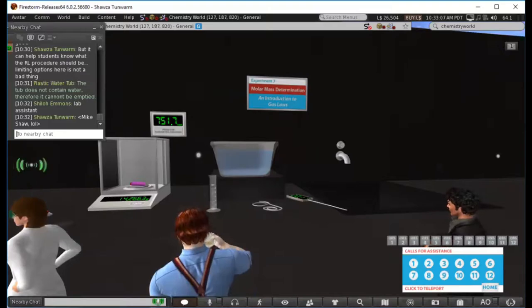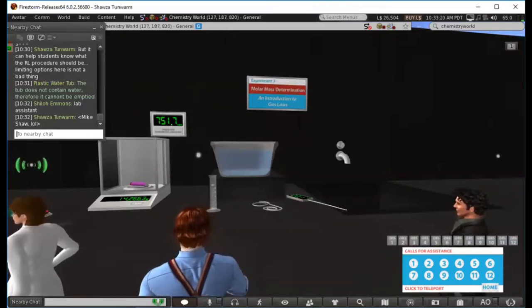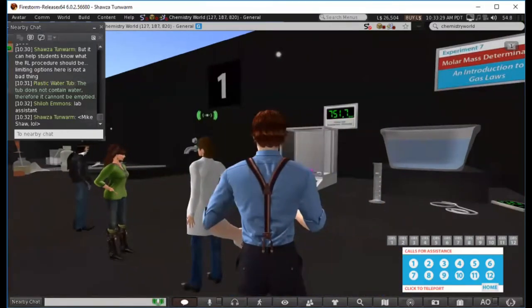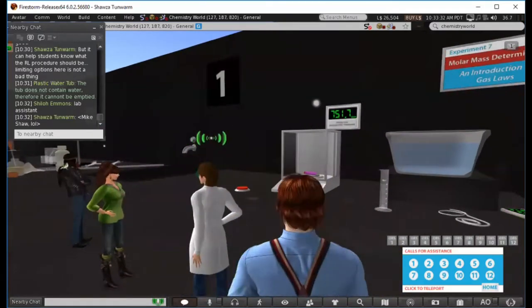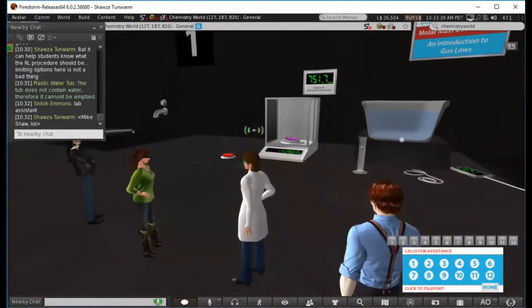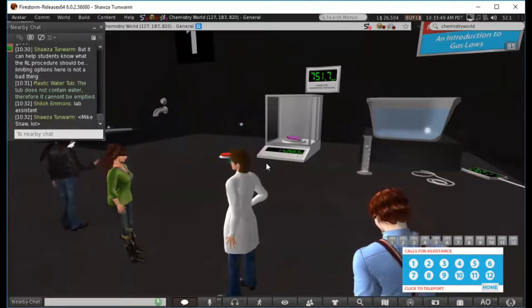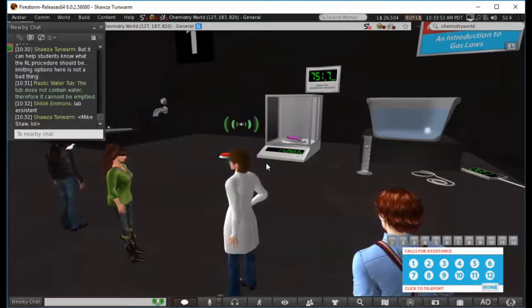We didn't think about it at the time, but there's one step in this experiment where the virtual lab skips over some steps, or does the work for them. It wasn't something we really thought about, but it turned out to be the case. That particular step, they did not perform very well in the lab practicum. So we really saw a strong correlation between the detail of the steps the students had to complete in the virtual lab and how that reinforced what they were supposed to be learning.